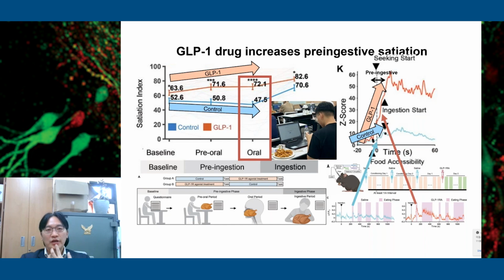We also did human brain tissue antibody staining, IHC, to show that this receptor is in this area. So I believe this phenomenon is also valid in humans. I think it would be better if we did the neural encoding in humans too, using the same behavior paradigm. But at this time, we did not do that. But we have an ongoing study to record the neural activity.